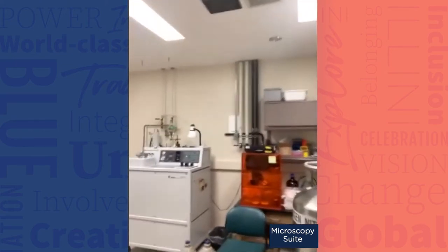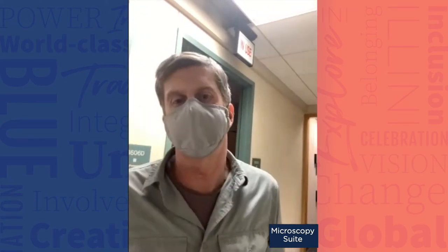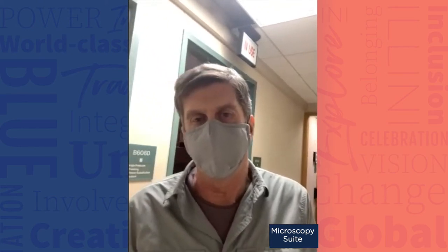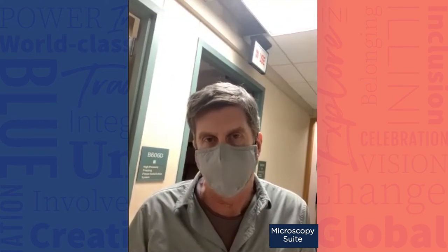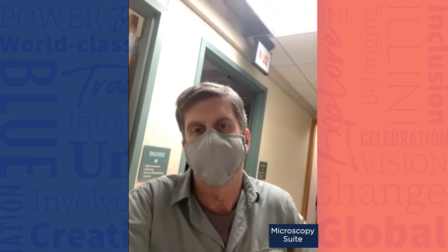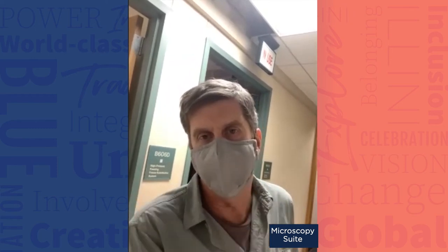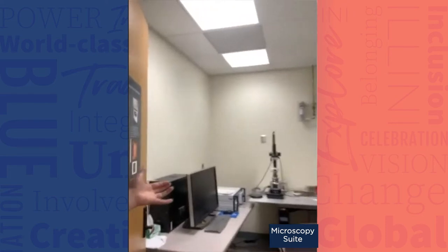This is high-pressure freezing and freeze substitution for transmission electron microscopy. When we're working with bio samples, we freeze the sample so fast that the hydrogens don't have time to rearrange, and our samples end up in vitreous — glassy — ice. This is what you do in cryo-EM: you're freezing samples in vitreous ice. We're taking samples that are a little bit larger, like nematodes, freezing them in vitreous ice and then taking about six or seven days to run them through a freeze substitution process, going from frozen in ice to embedded in plastic, while the ultrastructure is fully preserved.